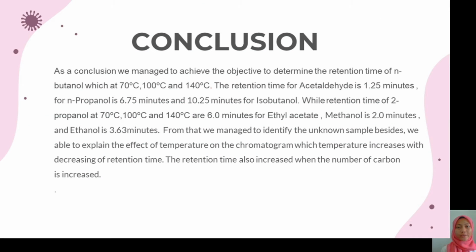As a conclusion, we managed to achieve the objective in this experiment, to determine the retention time of n-butanol at 70 degrees Celsius, 100 degrees Celsius, and 140 degrees Celsius. The retention time for acetaldehyde is 1.25 minutes, for n-propanol is 6.75 minutes and 10.25 minutes for isobutanol, while the retention time of 2-propanol at 70 degrees Celsius, 100 degrees Celsius, and 140 degrees Celsius are 6 minutes for ethyl acetate, methanol is 2 minutes, and ethanol is 3.63 minutes.